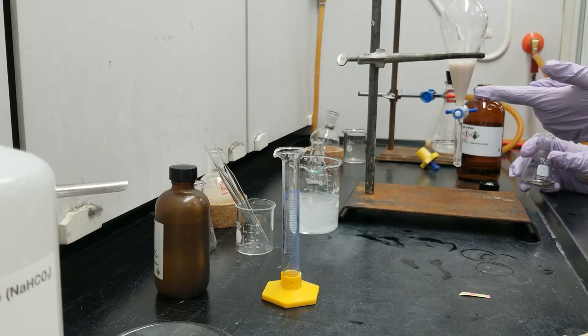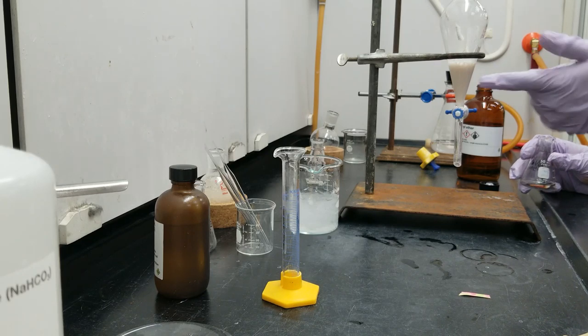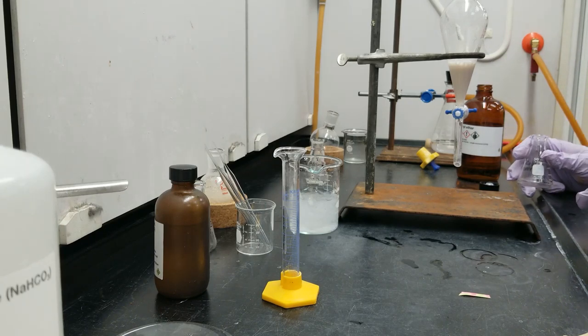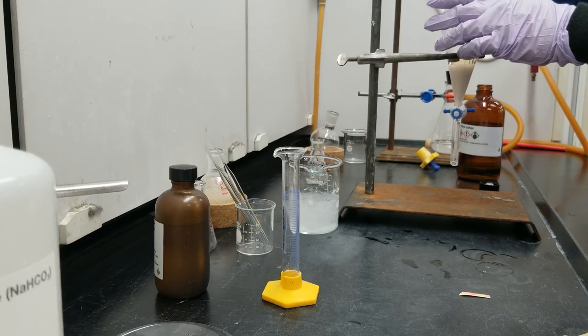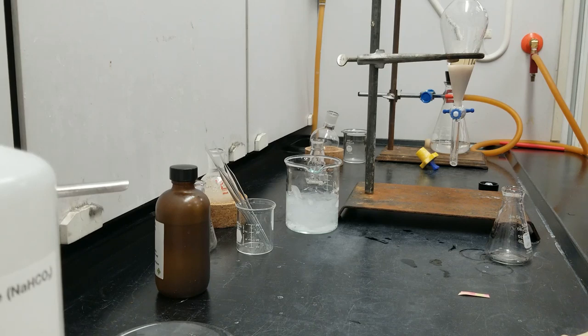So this is the acidified sodium hydroxide layer. Now we can see the whitish solid which has phased out of the aqueous layer. We're adding diethyl ether so that the solid gets solubilized again into the organic layer, and we're going to extract the same way that we did earlier. We're adding the diethyl ether two times, that means 20 mL of diethyl ether.